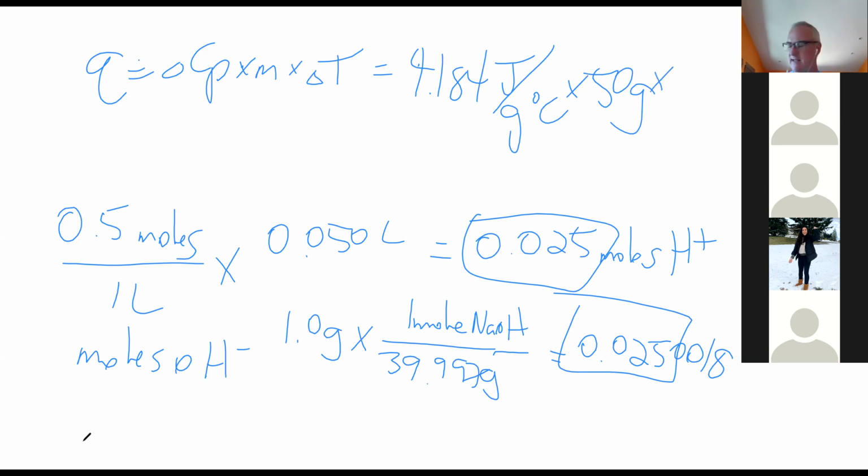And what's my delta T this time? It's a lot more, right? What is it? 11.97. Yeah, it went up big time.